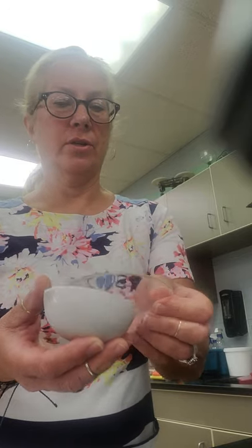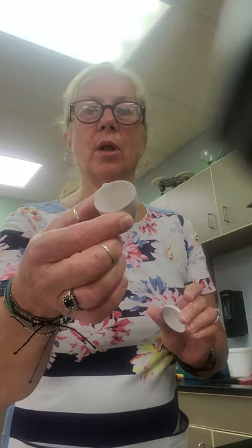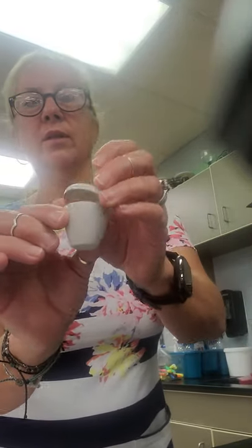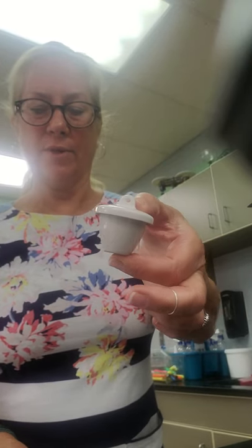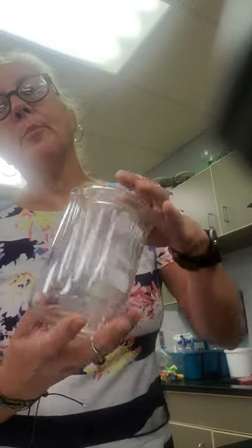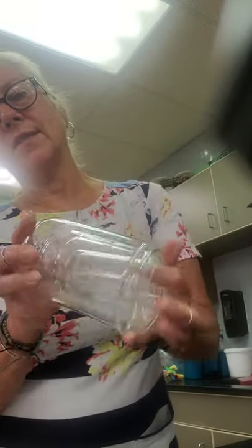Number twelve is evaporating dish. Number thirteen is watch glass — the watch glass is the lid for the evaporating dish. Number fourteen is crucible — crucible and lid is fourteen.